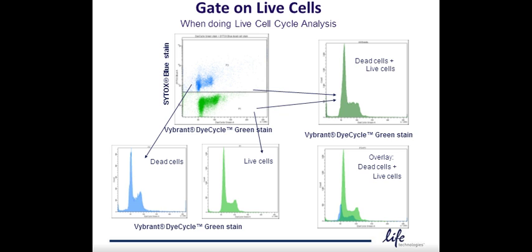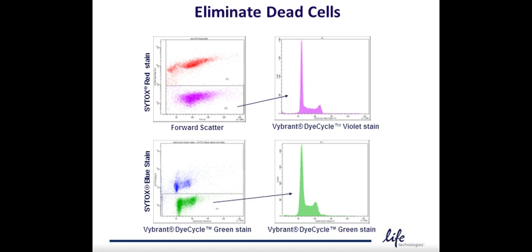The DNA content is no different in the dead cells, but the difference is due to the conformational changes in DNA as the cells are dying, and this affects how the DNA is stained. The elimination of dead cells when doing a live cell assay may be a new concept because using the classic dyes that require cells be fixed, there can be no distinction between the live and dead cells. With testing of live cells, one needs to consider this.